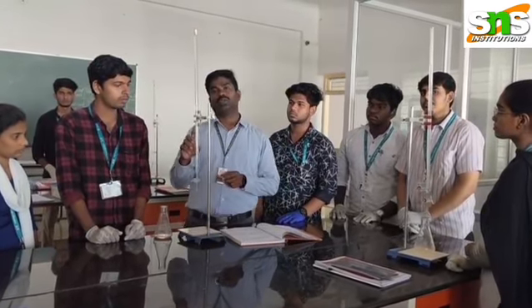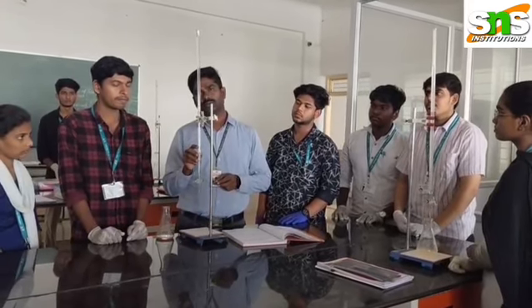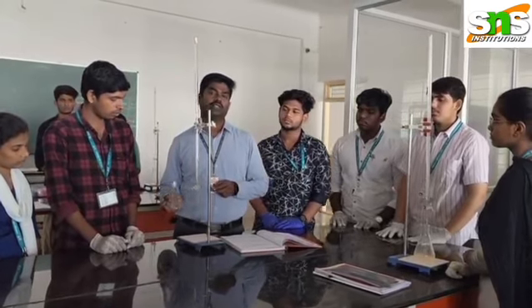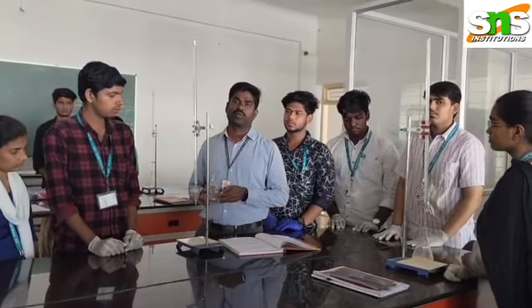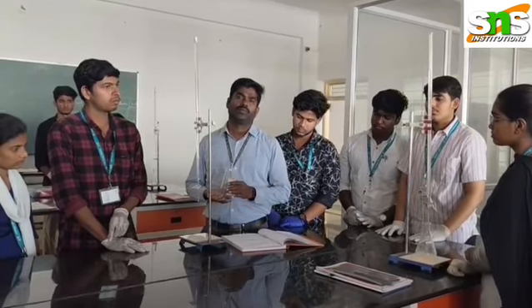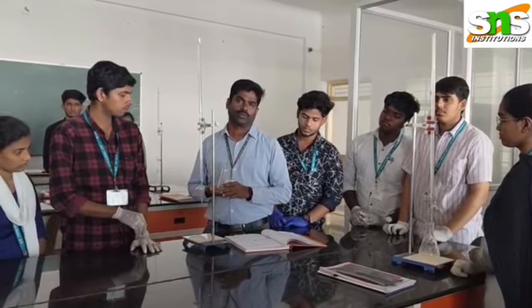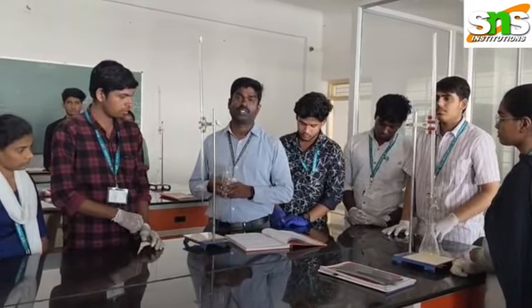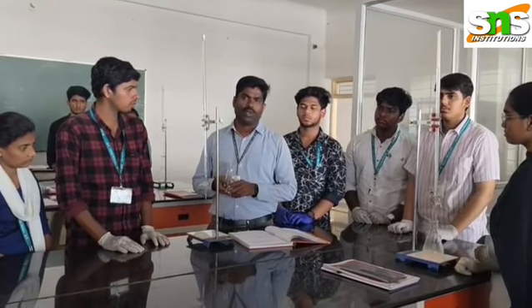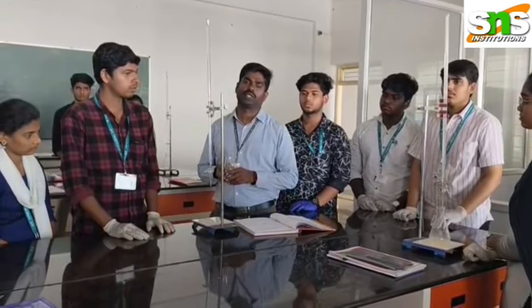This is of unknown volume and known strength. At the same time, as the titrate, we have taken this sodium carbonate solution. It is of known volume, taken in this conical flask, but the strength is unknown. So during this titration, we need to follow the basic principles of volumetric analysis.